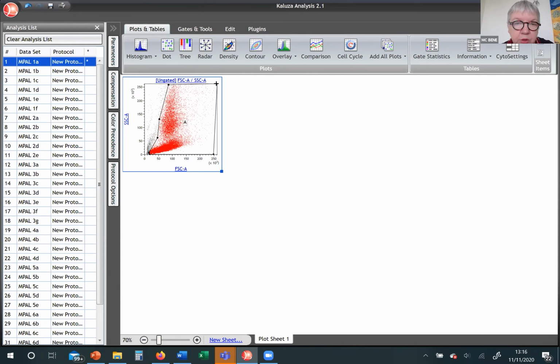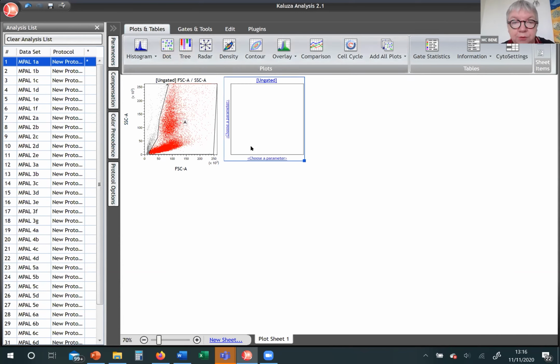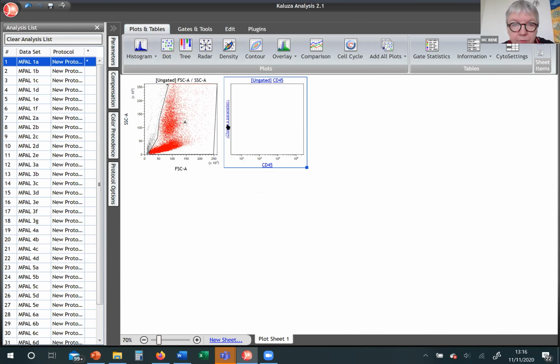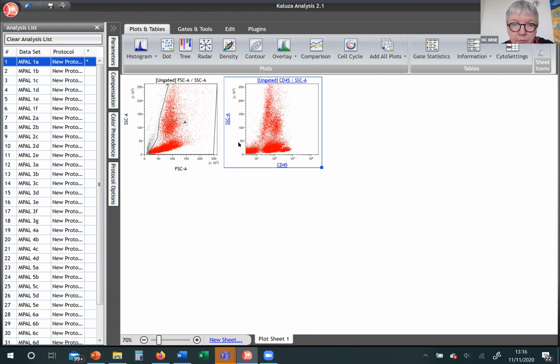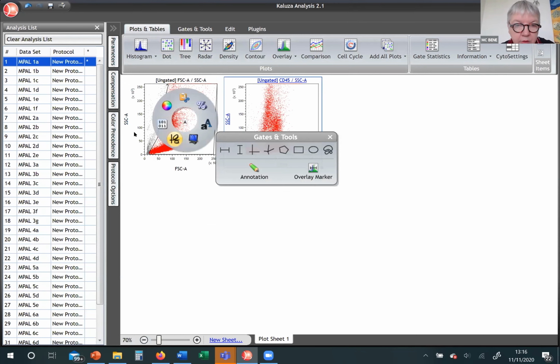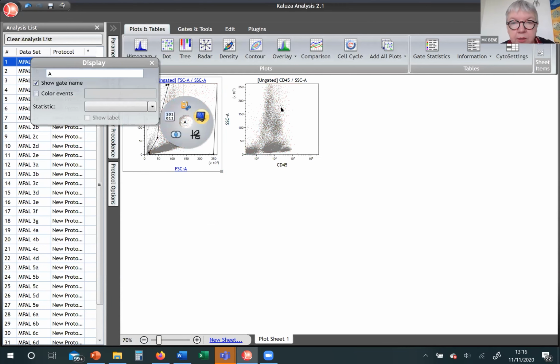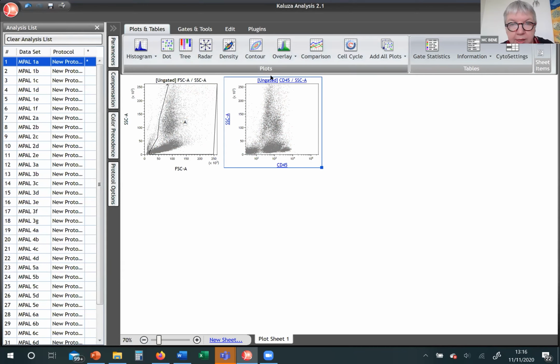And here we are. For diagnosis it's not important, but if you do MRD, it's important that you also get the cells that are stuck over there on the top, so that you really take all the leukocytes from your sample. Then we make a CD45 side scattergram, and we remove the debris here, away. And now we're going to enlarge this one to make our gates.